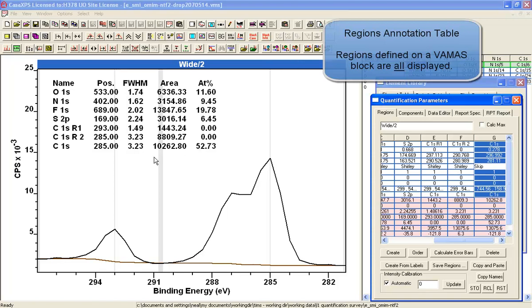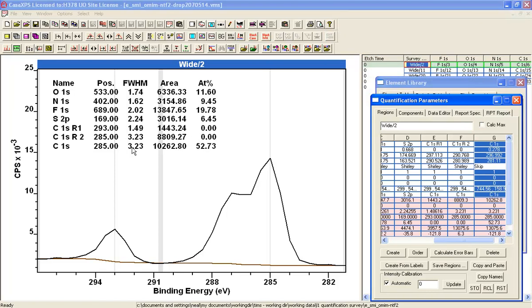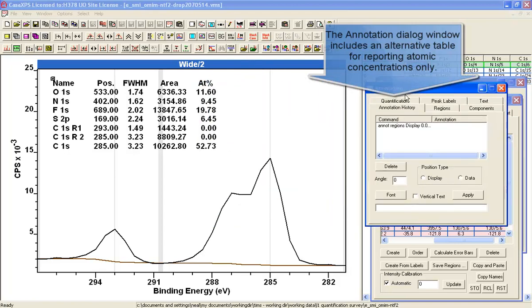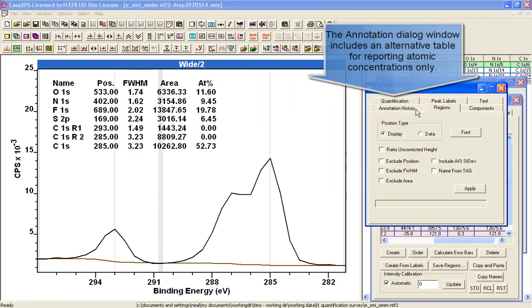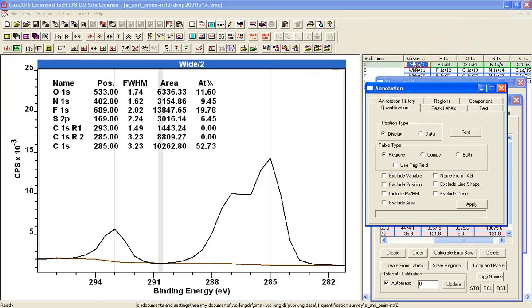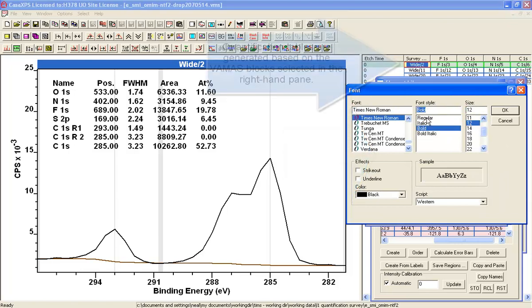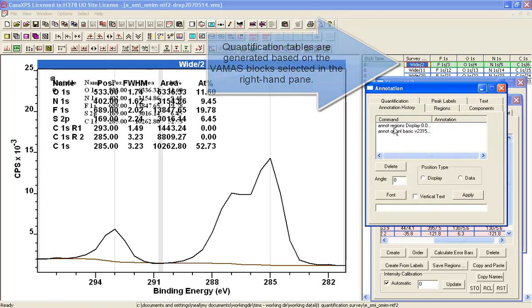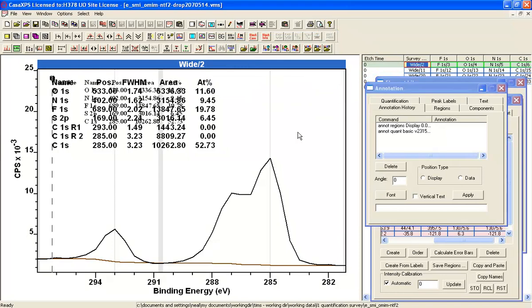Now, if I wanted to see a report that is just going to have the values that have RSFs that are assigned. In other words, the ones that will give me a contribution to the atomic concentration calculation. Then, I can create from the annotation dialog window. Rather than using regions, which is what you can see already, I'm going to go to the quantification tab, which will rely on what I've got selected in the right hand side. It's got regions selected and I can set myself a font and then say apply.